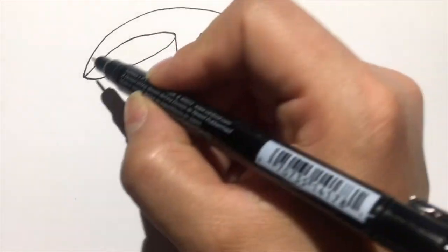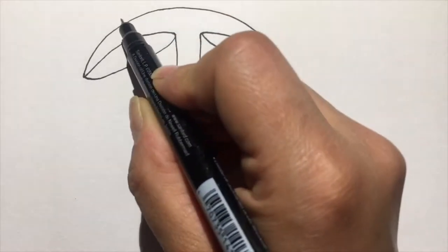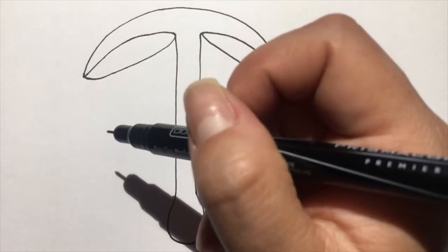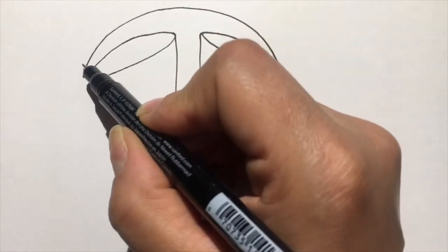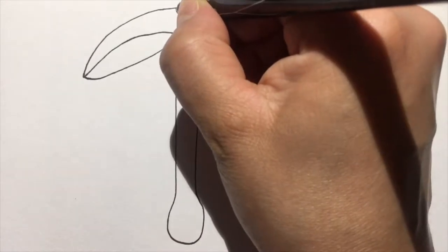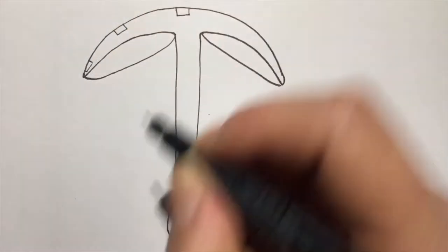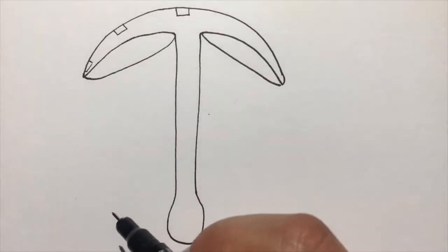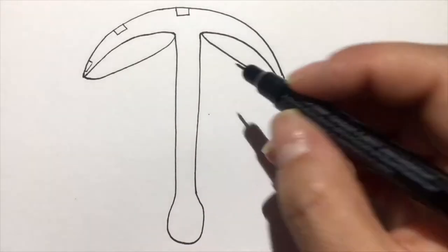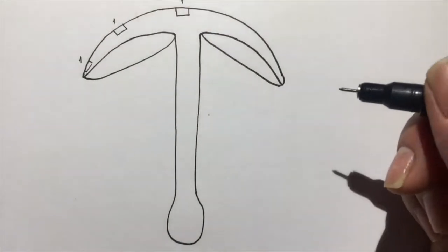So if you're going to cut from the pileipellis to see different placements of the volva and volval material, you might want to start in the middle. Towards mid-radius, and at times you may even need to go towards the very edge. So we're going to mark these as one, meaning this is from the cap.